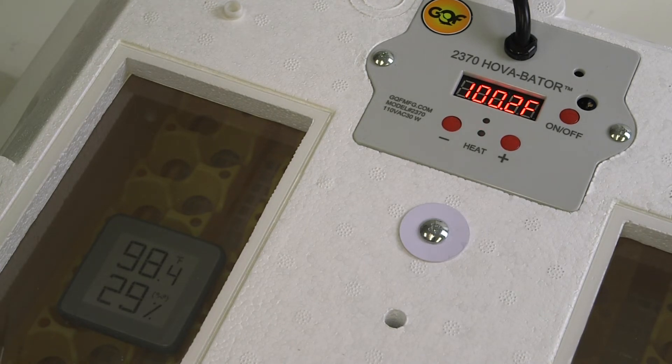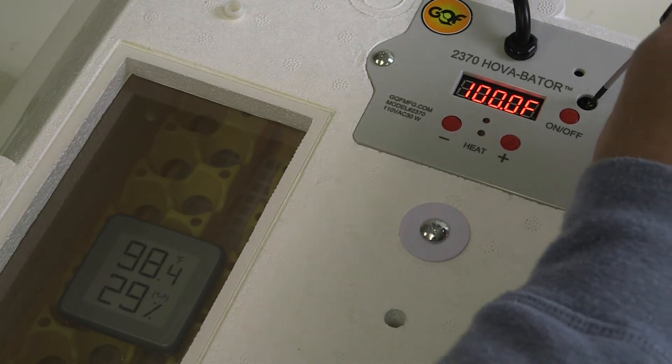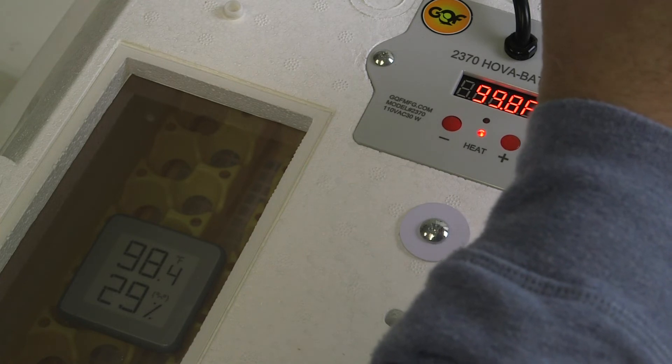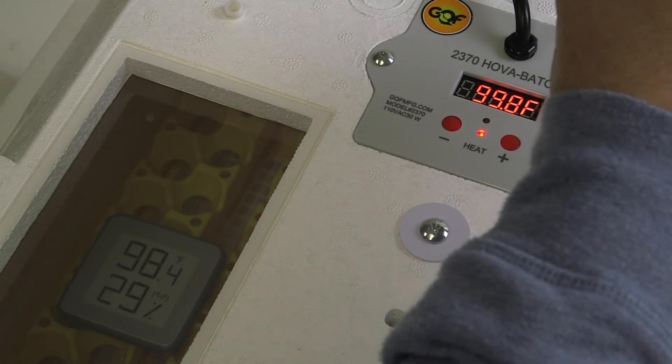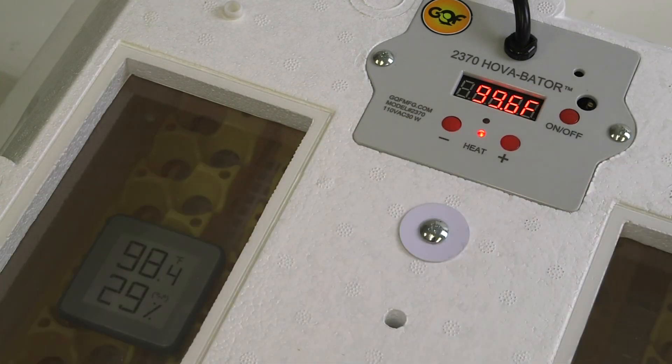If you'll notice, we need to add almost two degrees to the inside of the incubator. By doing so, I want to turn this screw counter-clockwise. Counter-clockwise will add temperature to the inside of the incubator, and clockwise will take temperature away.